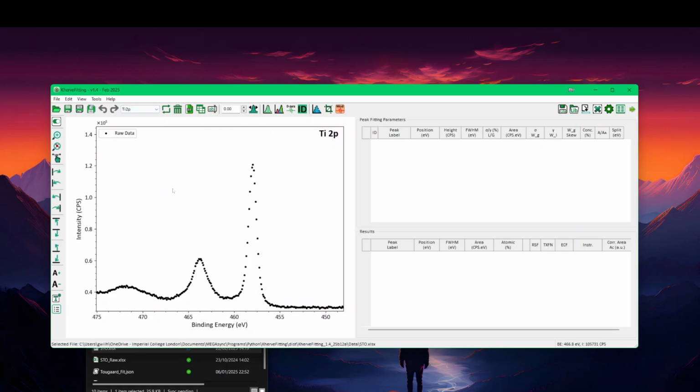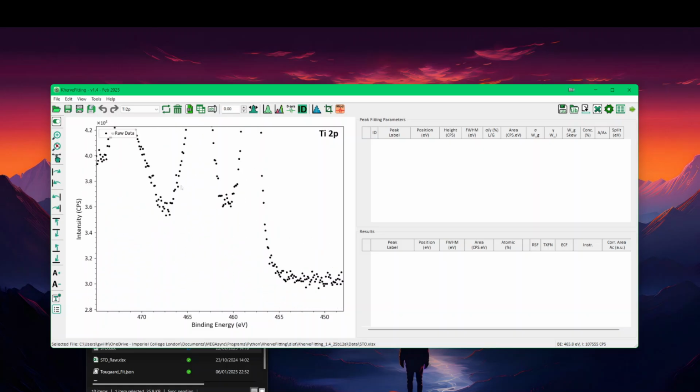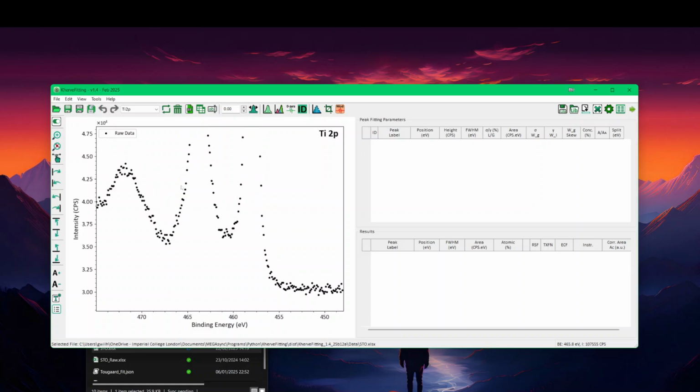Okay. Now I'm going to explain section 3, which is the different types of control. The plot control: if you keep pressing the control key and use control left or right, you can move your axis. If you use up or down, you can zoom into the noise, and that is quite nice when you try to place your background.